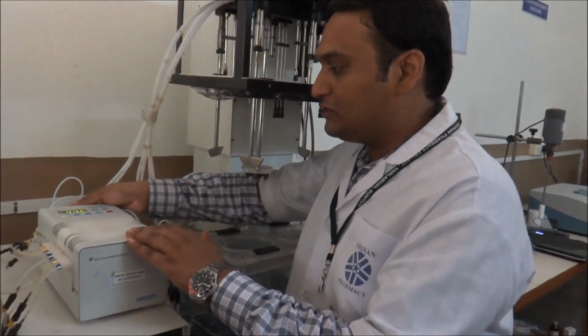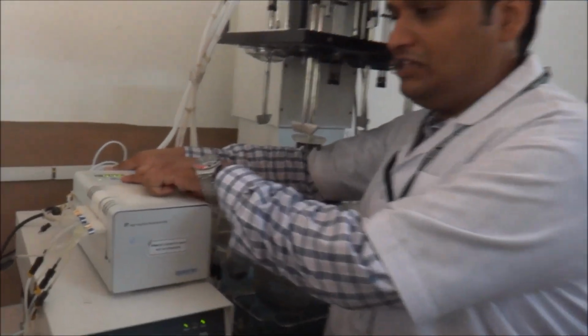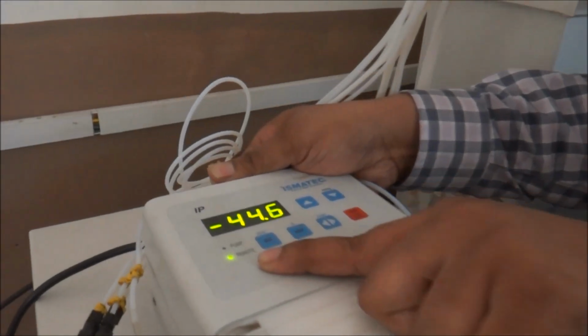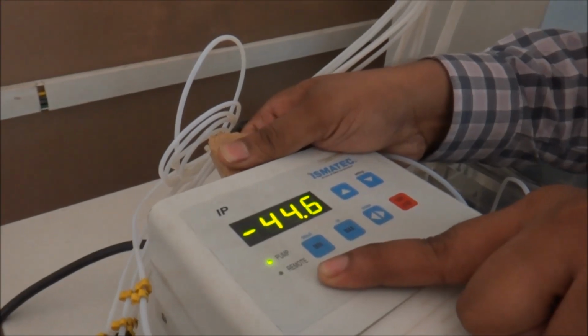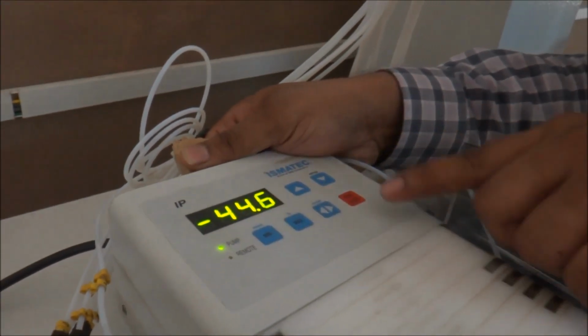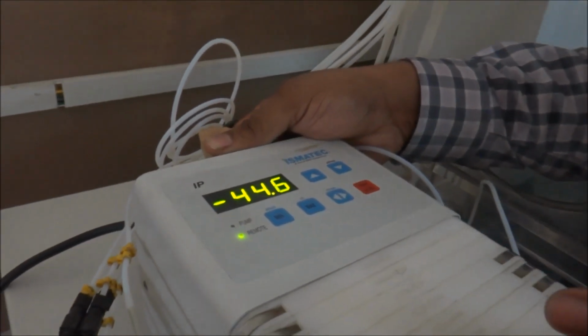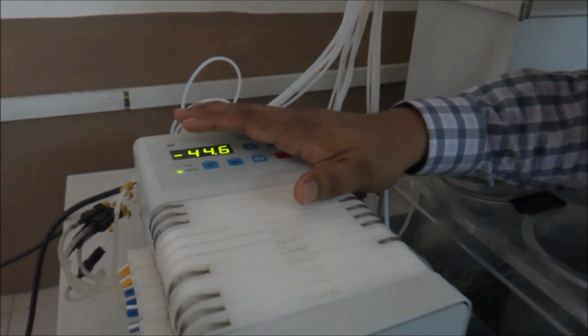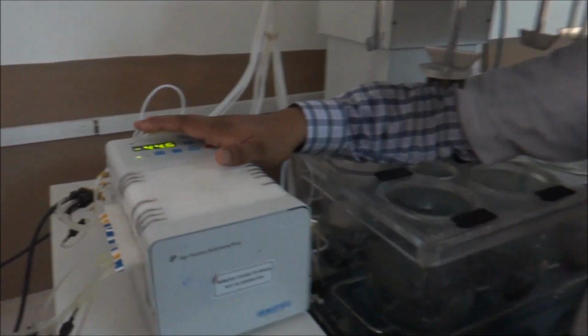Now as you can see this plug, when I remove this plug, you can see the change of this particular light from remote to pump mode, indicating that now the pump can be operated directly from this particular panel. When I place it back, it changes again to remote mode. So here the remote mode indicates that it is under the control of CPU.